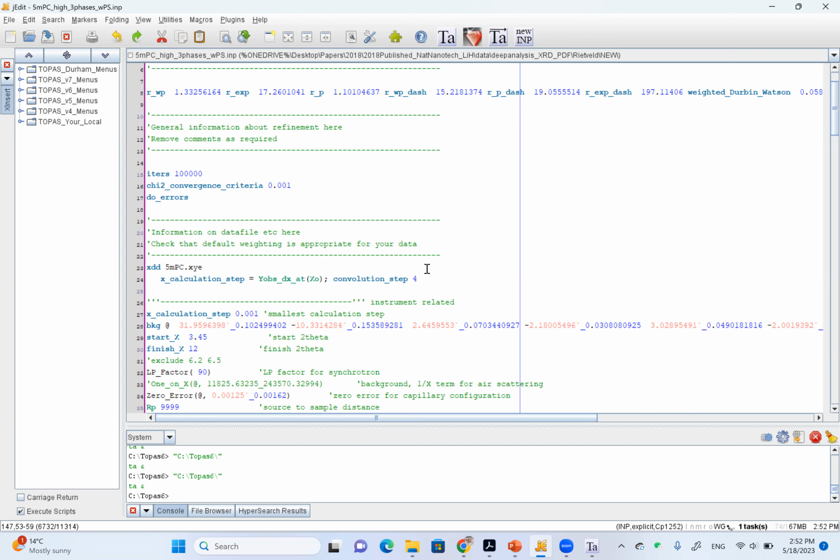Yeah, you can define the reasonable range for your B parameters. It should not be very small, should not be very high. You can define them using the minimum and the maximum definition. Okay. So yeah, other than that, I guess that's pretty much what I want to share with you today. Yeah, we may still have some time for questions. Do you have any questions?